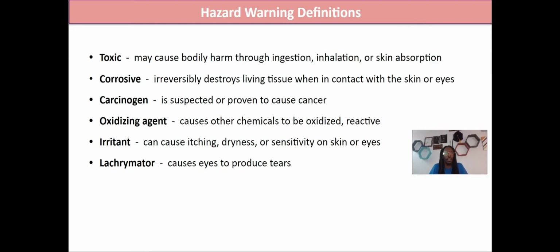So, we got toxic, which is basically it can cause harm to you if you inhale it, smell it, if you're eating it, or if it gets on your skin in some type of way. Hopefully nobody's eating these type of chemicals in that way. Well, I mean, there's other chemicals I'm pretty sure you guys might be doing, but I don't need to know nothing about that. All right, corrosive.